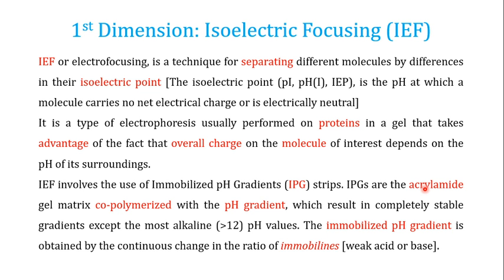So the first dimension in the polyacrylamide gel, as I've told you, is the isoelectric focusing. Now the isoelectric focusing, also known as electrofocusing, is a technique which separates different molecules by differences in their isoelectric point. As we are focusing on proteins over here, the isoelectric focusing is separating different proteins by differences in their isoelectric point. So the first thing is, what is an isoelectric point?